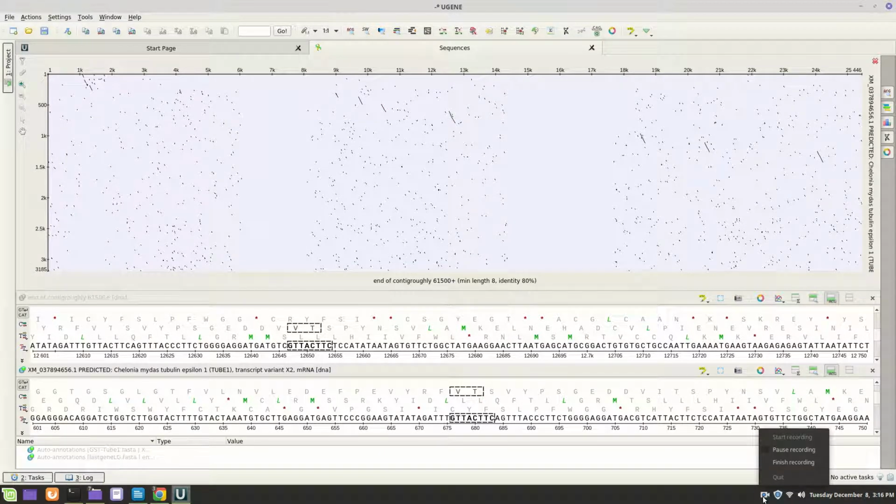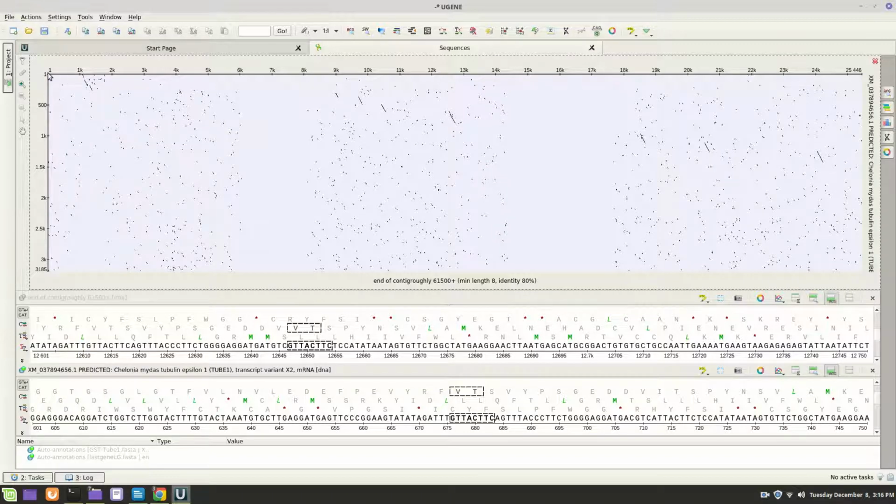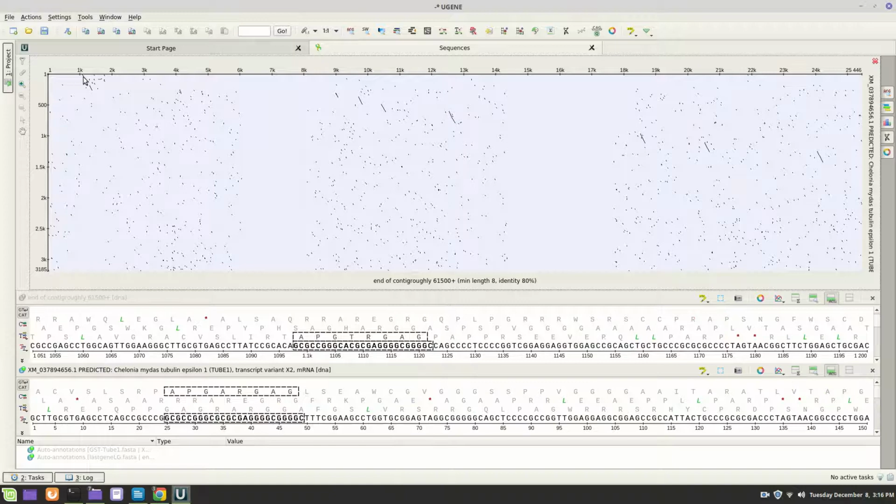This is probably one of the harder pieces of this assignment, but if you just go slice, it's going to tell you where everything is at. And the great thing about it is it also tells you where the transcription start site is. It's going to be up here somewhere. Wherever this one starts is probably where this one starts, or at least you can guess. You look at the criteria for it, and you know it's before the place where the mRNA starts, so you know this is the region that you're splicing. It's not going to be too far ahead of your first thing.